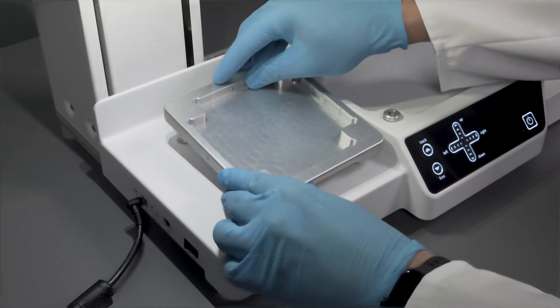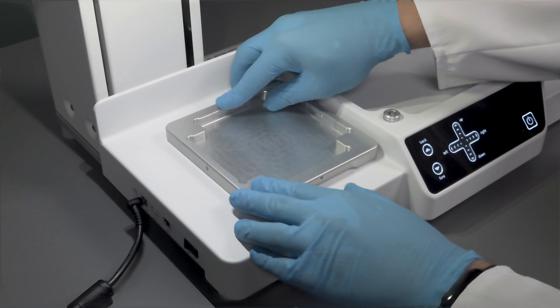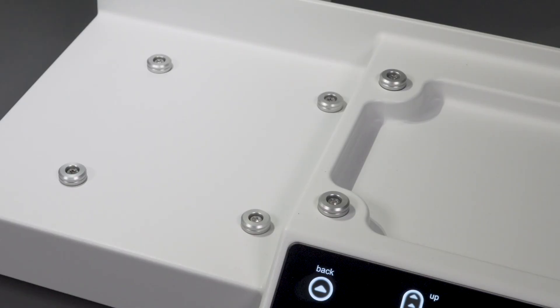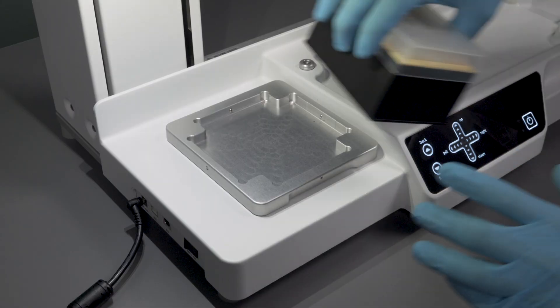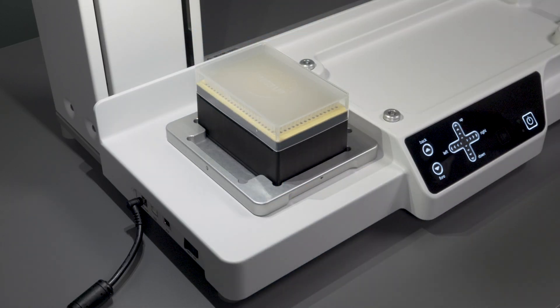To set up the instrument, first place the tip rack deck on the left side of the instrument. Please make sure that the deck is firmly attached to the base unit. On this position, Integra's grip tips are accommodated.